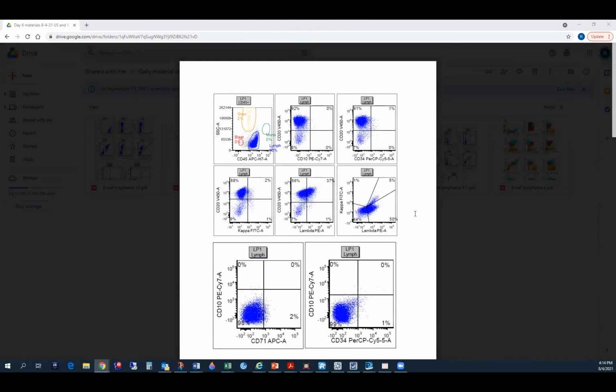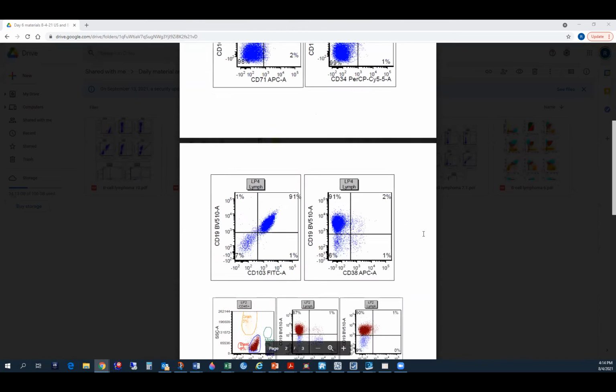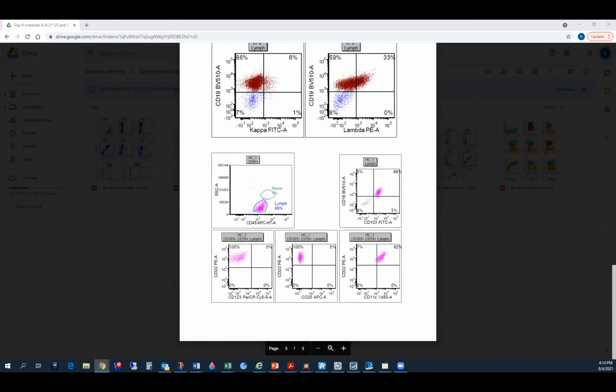And 11C in splenic marginal zone won't be that bright, right? This is not too bright anyway. It's kind of positive. I mean, if it is bright, I would expect it here. Okay, so that is not a point. I read it somewhere, so I'm just confirming. As far as the brightness, I have to go back to the books and check. I know that they can be positive. They are usually positive, but I don't know about the brightness. Okay.